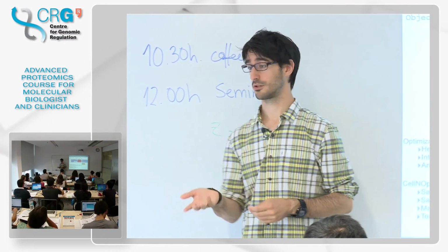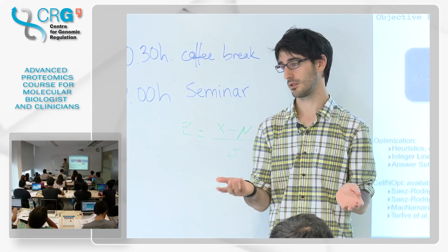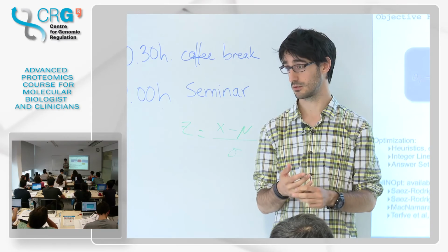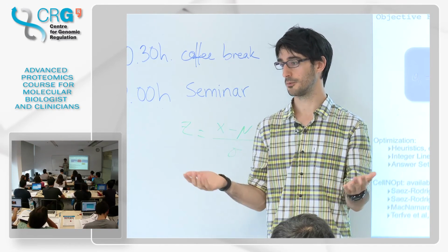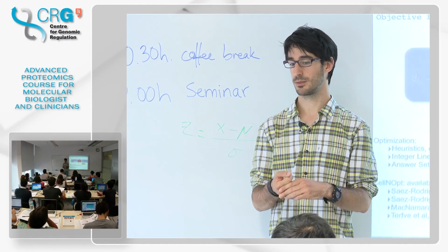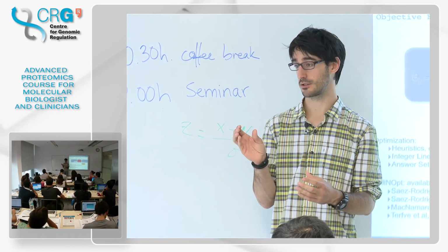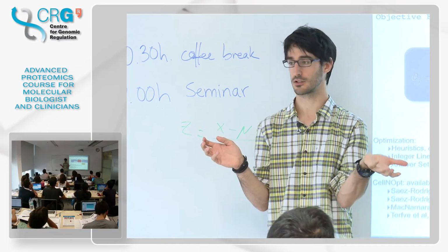But you can also be introducing false positives. So you will end up finding a network that fits your data very well but has nothing to do with what's going on in your biological experiment. That's why I would recommend to be very stringent when you use the signaling network at the beginning. Don't just download the whole human interactome and then compare it against your data. It's a problem where you have so many variables compared to your data points that you will always be able to find a solution.